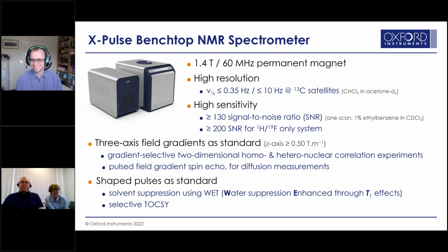Carbon, very much so, I would say you can run carbon. The carbon spectrum we showed here was probably a 1 molar solution, and they'd have been obtained in under an hour. I'm not willing to guarantee exactly which ones they were without looking closer at the original metadata. Okay, no, I think that's a good ballpark for people to get an idea if they're familiar with what they're talking about.